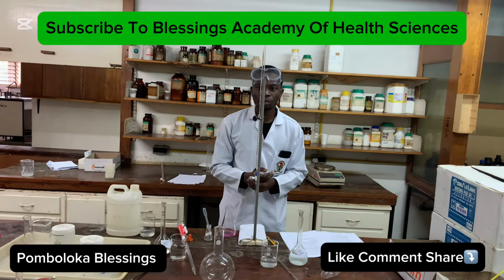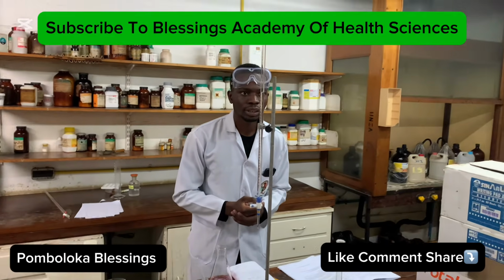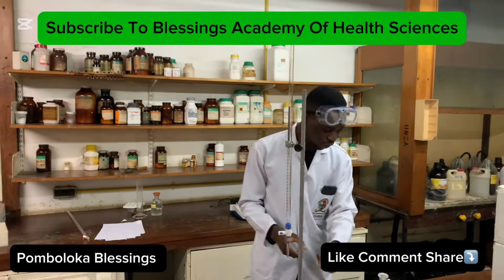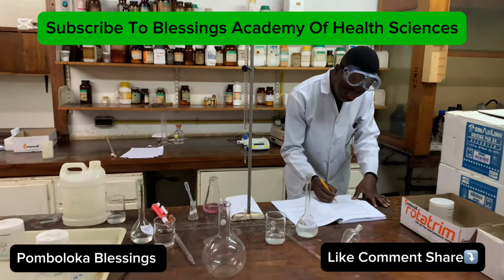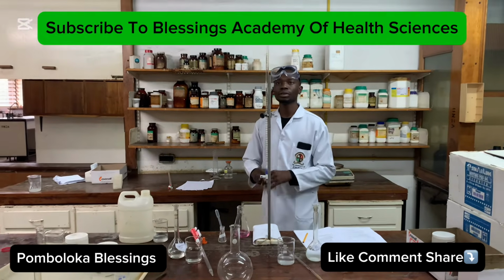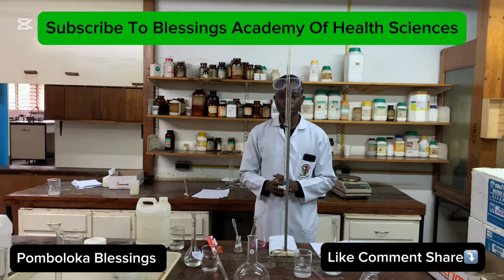And then we have the first one as 16.8. The first trial that we have here is 16.8. Okay, that's the first trial that we have there. So our initial volume that we started with is 0. And then we have our final one as 16.8. So we're equally going to do the first part, the second part, as well as the third part.